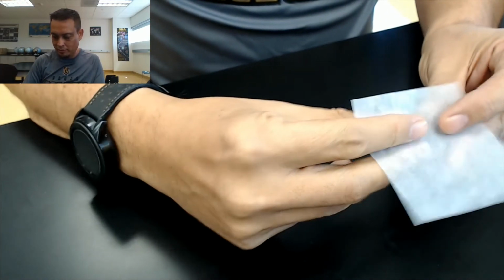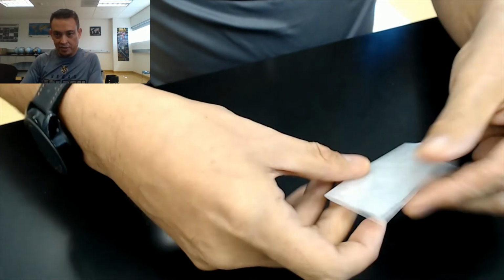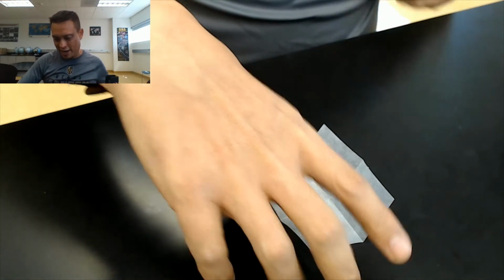All right, everybody, before we can actually start doing the actual experiment, one of the first things you need to know how to do is how to prepare a sample and how to run the melting point apparatus. So let's go ahead and take a look here. When you grab your samples from the bottles, I recommend that you use weighing paper, wax weighing paper. And then I always recommend that you fold it in half, and then you fold it in half again. What this does is it puts a little divot in the middle here, and it also props it up like this, almost like a little makeshift weigh boat. So your samples won't fly all over the counter, preferably.